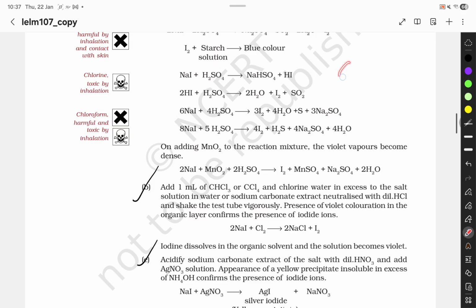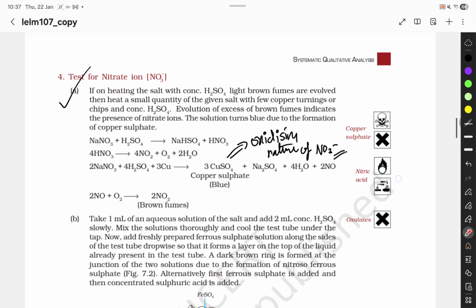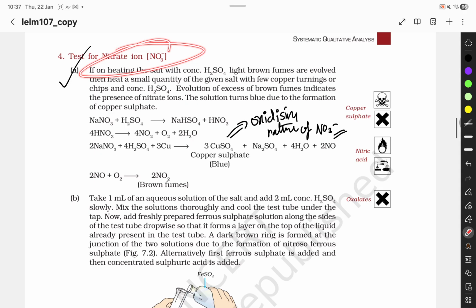Okay, and the same test can be conducted for Br2. It's the same as for I2. Cl, Br, I are brothers. Basically, for Cl obviously you can't perform this test, but yeah, this is also obvious. I'll be skipping it.